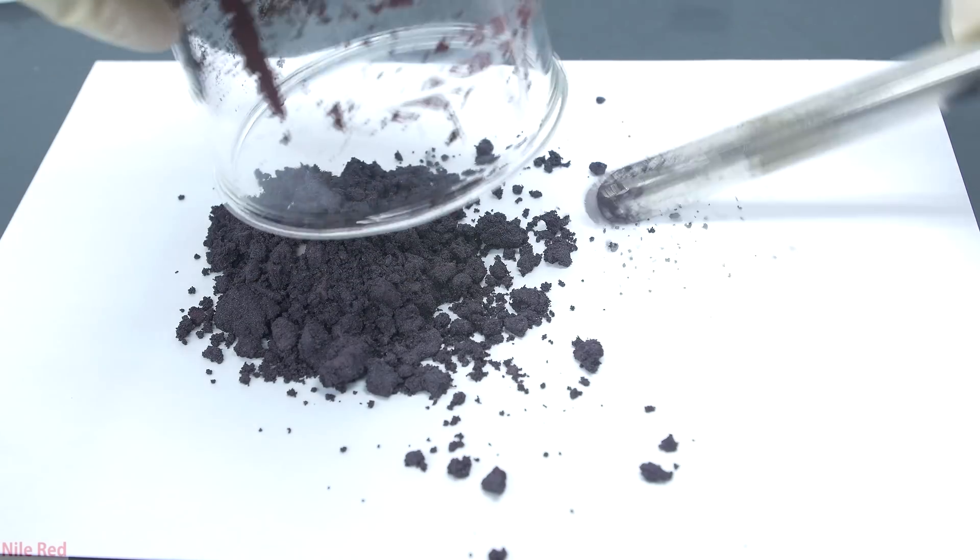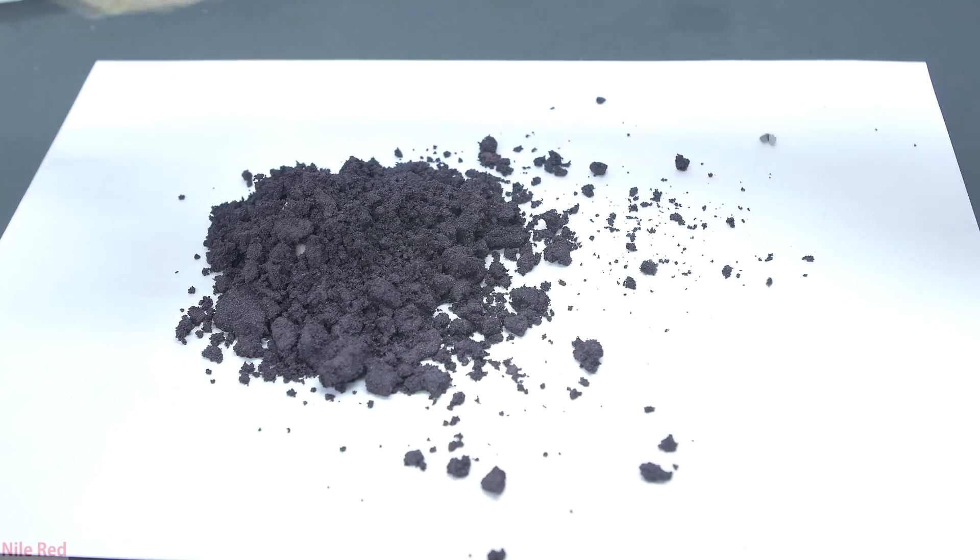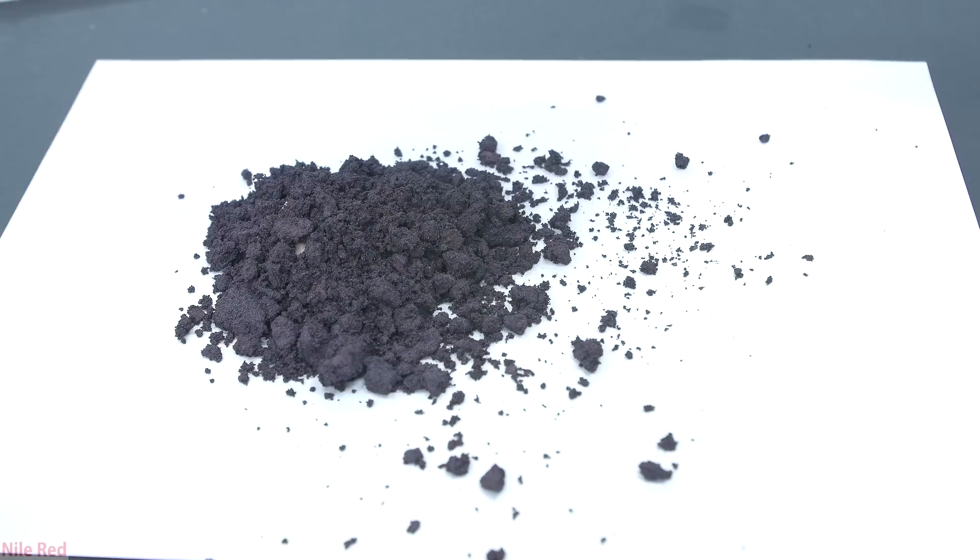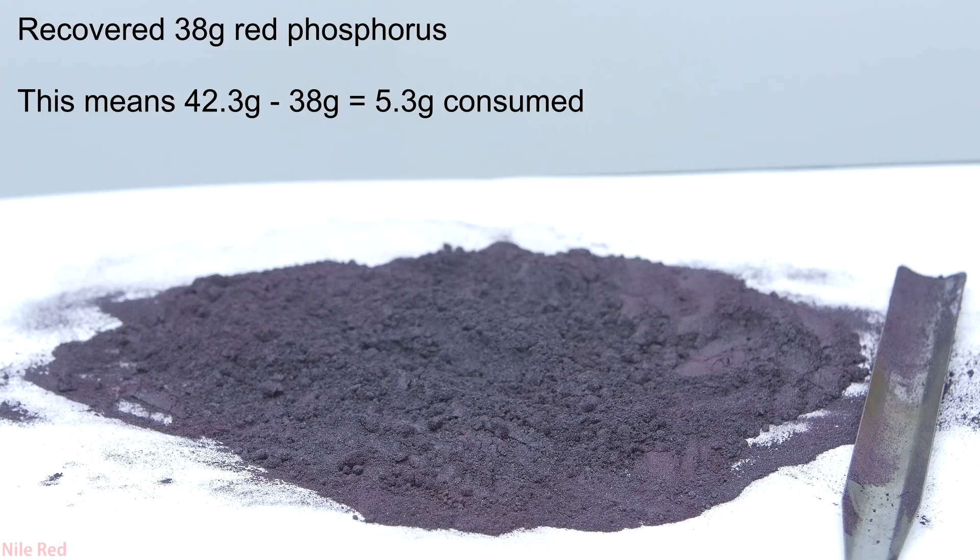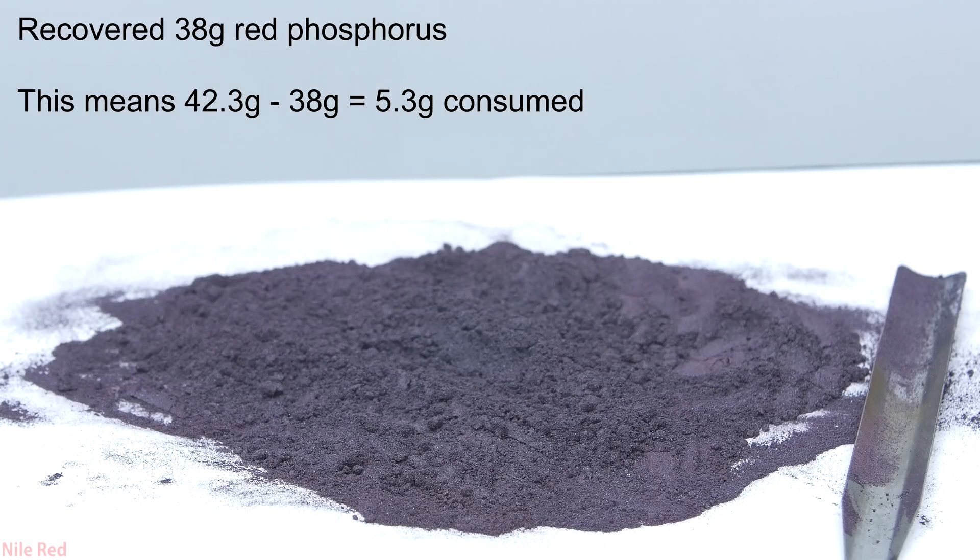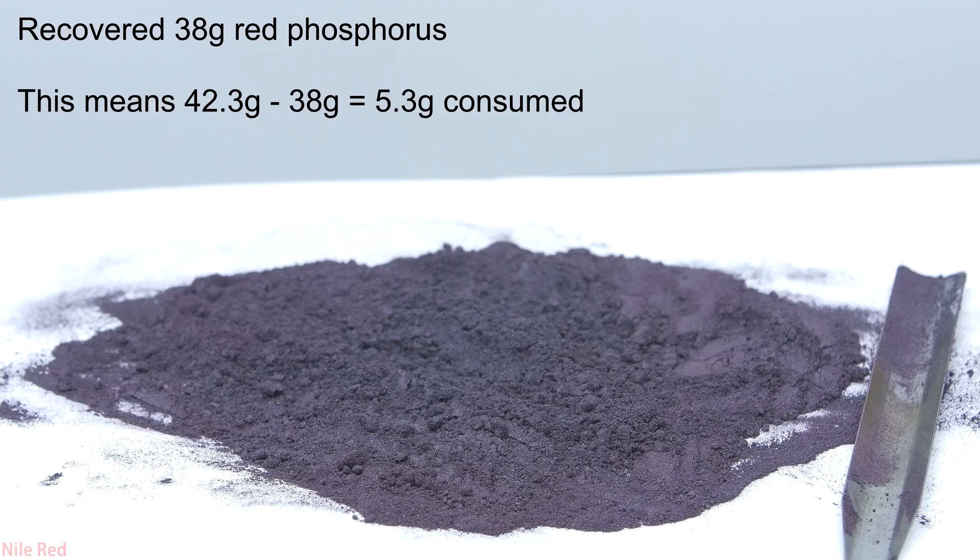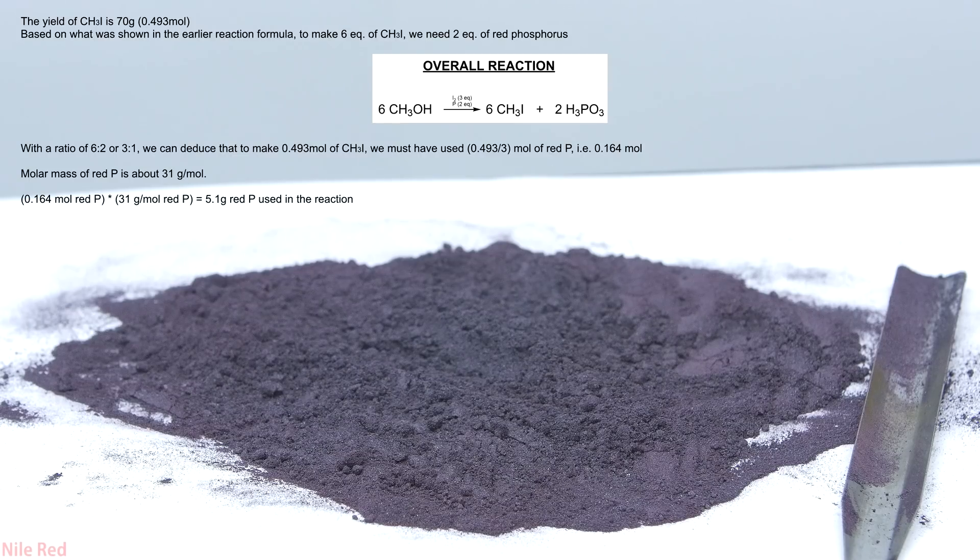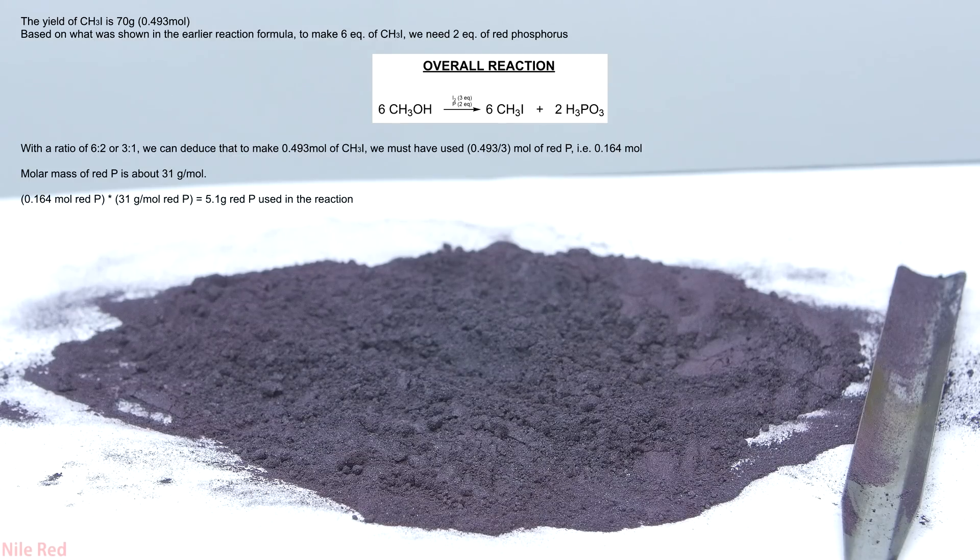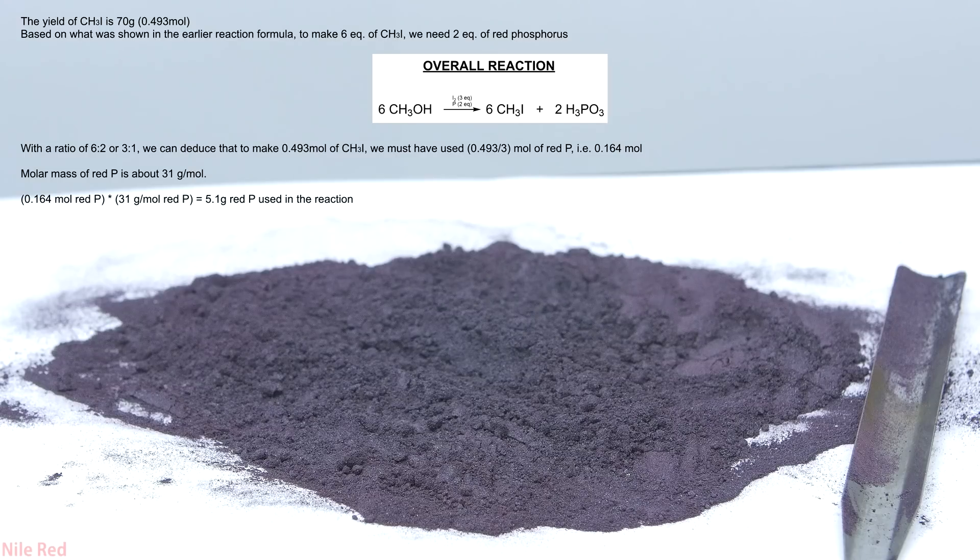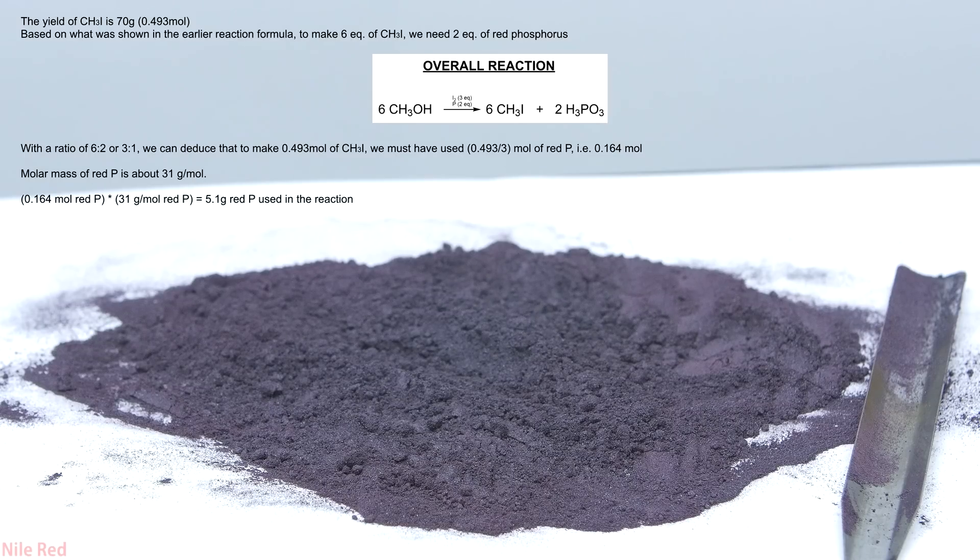Right now the red phosphorus here is still a little bit wet, so I simply leave it out in air to dry and then weigh it to see how much we recovered. In the end, the recovery of the red phosphorus was about 38 grams, which means that only about 5 grams of red phosphorus was lost in the reaction. This makes sense, and if we calculate how much red phosphorus we should have used based on how much methyl iodide we produced, it comes out to be around 5 grams.